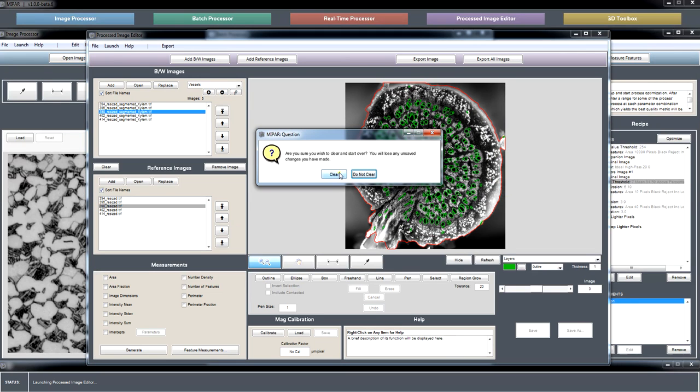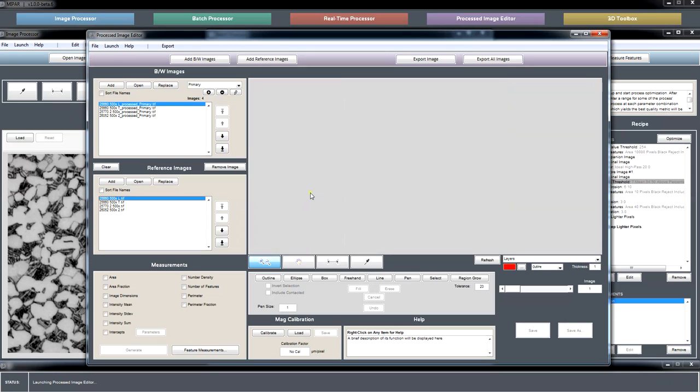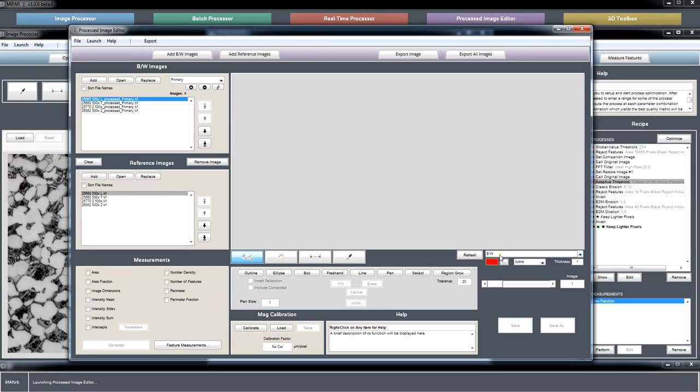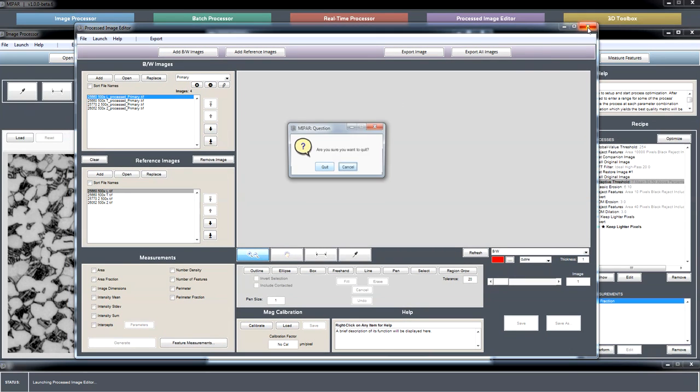And now review the processed images. We already have it open, so we'll say yes, we want to clear what's there. And this, of course, brings up Johan's bug that he found, where having layers set, I guess, when images are being brought in, can throw an error.